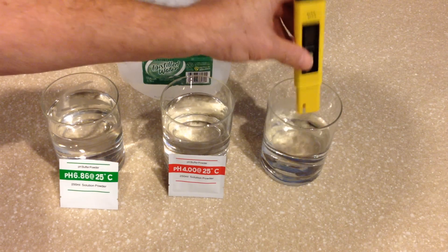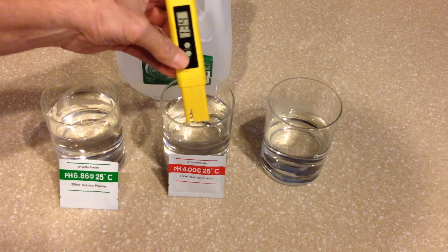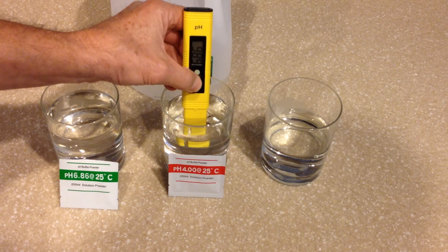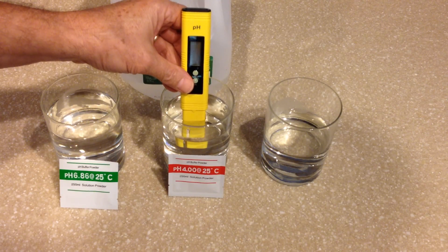I'm going to rinse it off in the distilled water, dry it off a little bit, then simply put it back into the 4.0 solution. Again, I'm going to press the calibration button for three seconds, release, and then press it one more time and it'll start to flash at 4.0. When it stops flashing, it'll be completely calibrated.